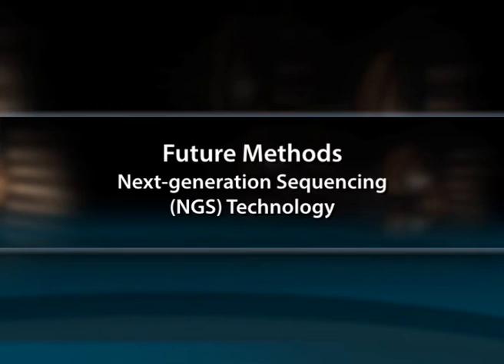Future methods or next generation sequencing, NGS technology. Next generation or second generation sequencing technologies have largely supplanted first generation technologies. These newer approaches enable many DNA fragments, sometimes on the order of millions of fragments, to be sequenced at one time and are more cost efficient and much faster than first generation technologies.